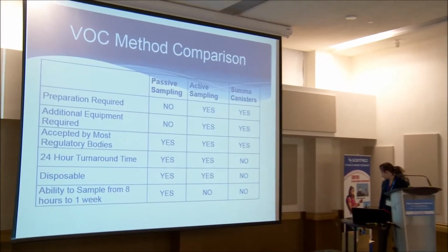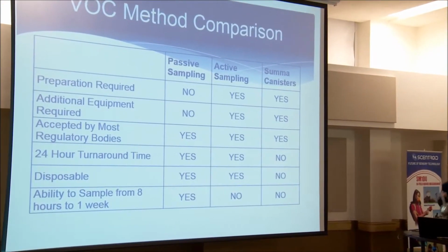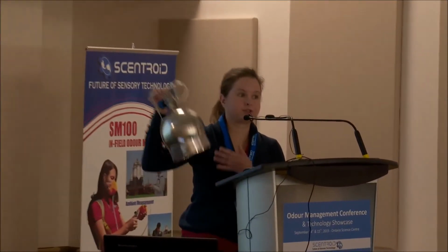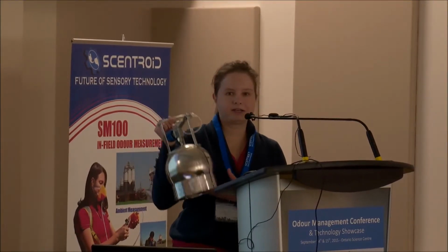So I actually don't like a Summa canister. It's big and bulky, and if you have to do multiple samples, you're carrying them around and it could get a little cumbersome.